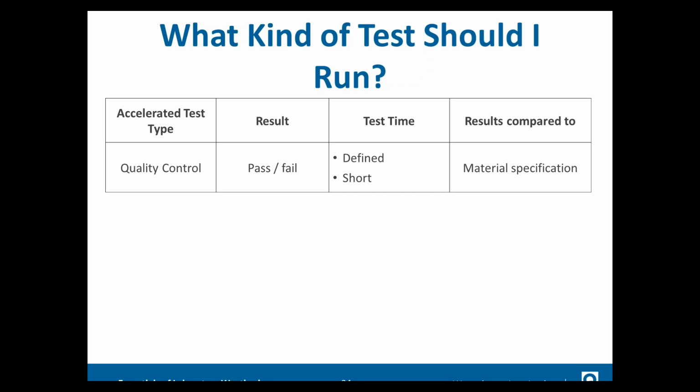Did somebody forget to add the UV stabilizers? Did somebody fail to actually seal a part? So this is going to be a fast test, and this isn't going to give you any correlation to how it's going to perform outdoors. It's something that you can run on every lot that won't break the bank, but will tell you whether or not a supplier has changed the way that they do things.